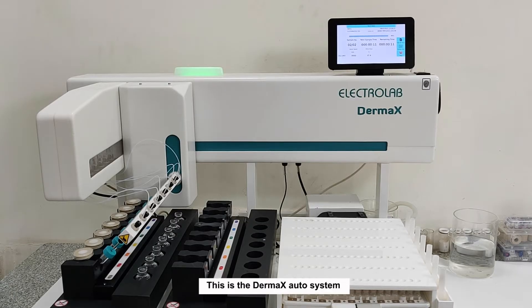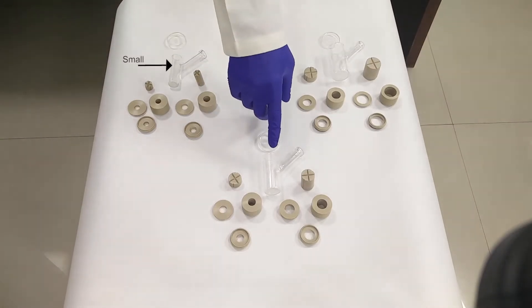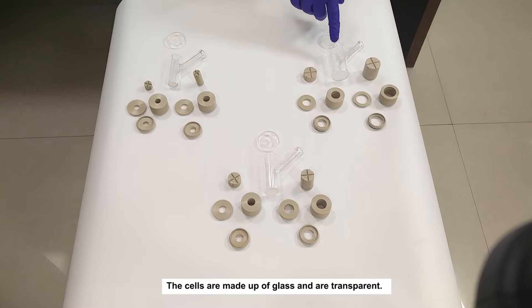This is the Dermax Auto system. Three types of cells can be used: small, medium, and large. The cells are made up of glass and are transparent. For light-sensitive products, amber cells can be used.